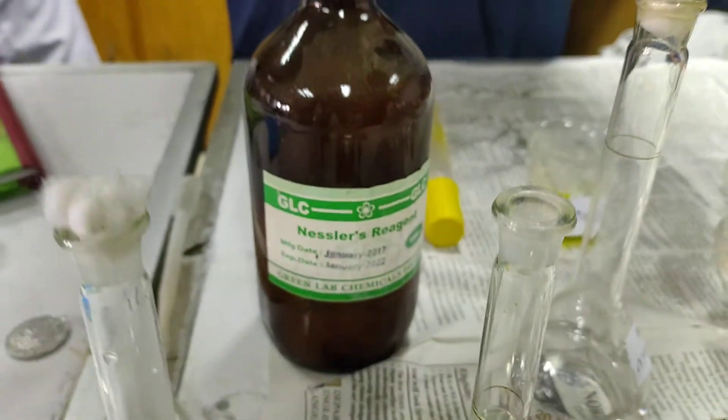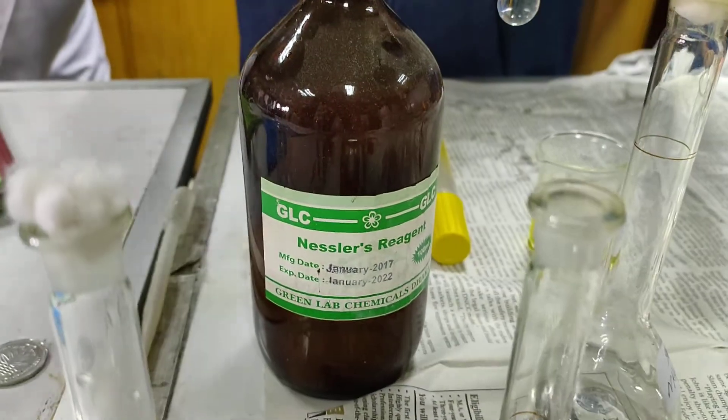Into this sample solution, we are going to add Nessler reagent. This Nessler reagent will cause brown precipitation.